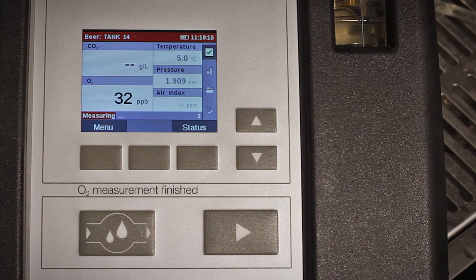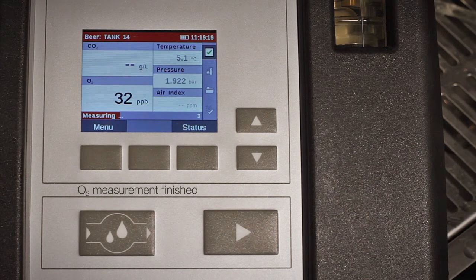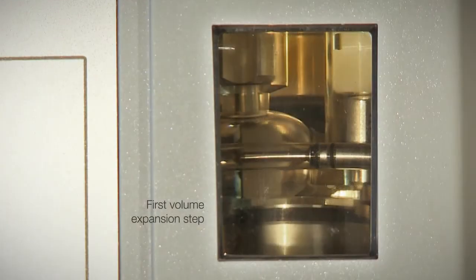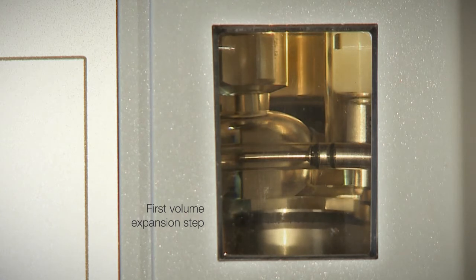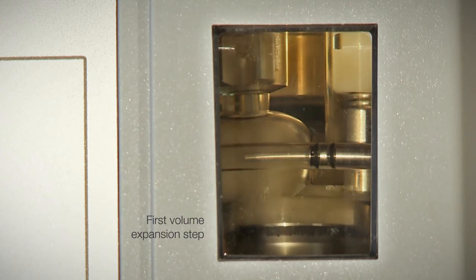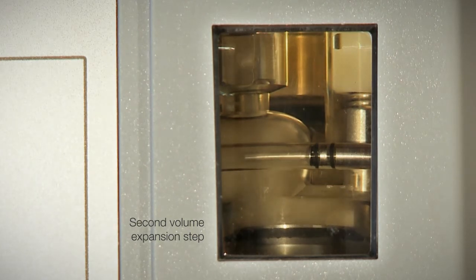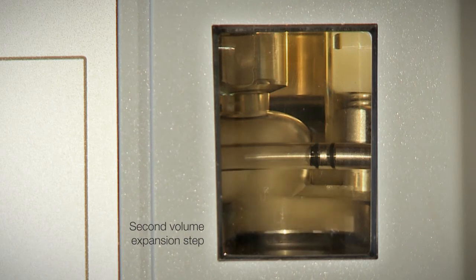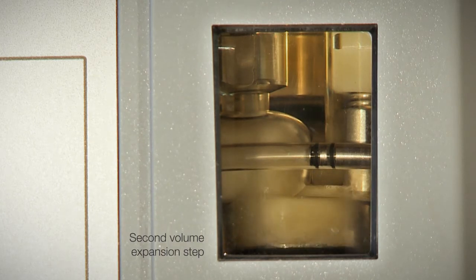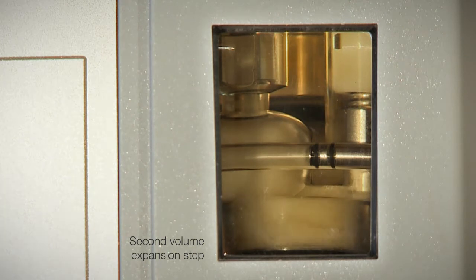As a first step, the O2 measurement is performed. After that, the CO2 measuring chamber is closed. The piston moves down and expands the volume for the first time. The pressure and temperature are measured. Then the piston moves down further and the volume is expanded a second time. The pressure and temperature are measured once again.